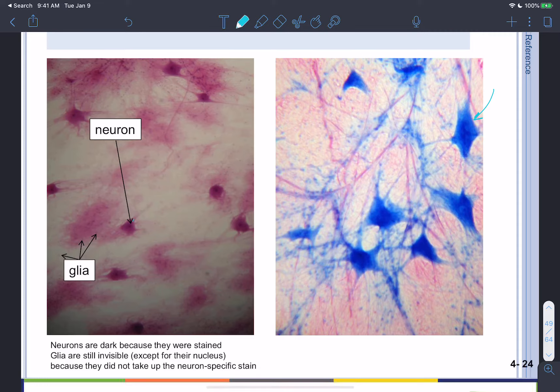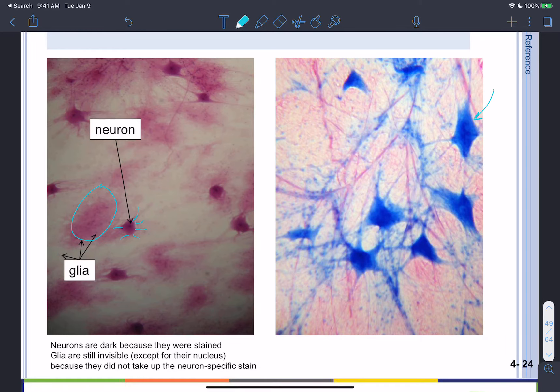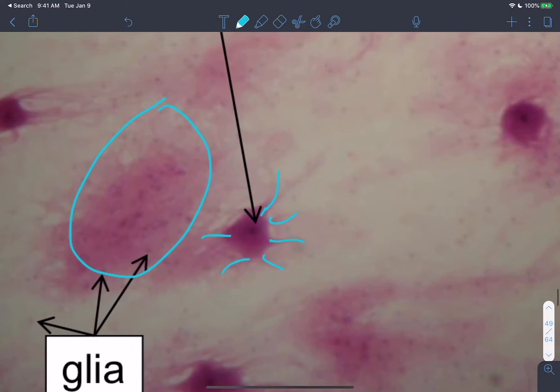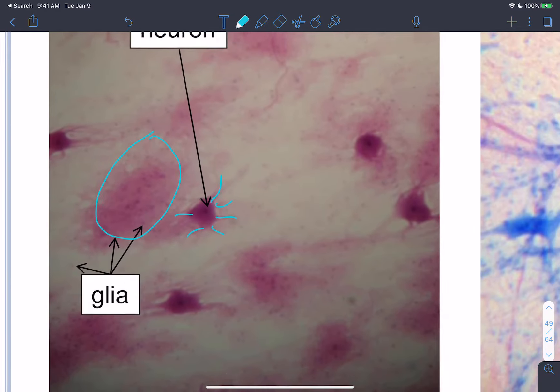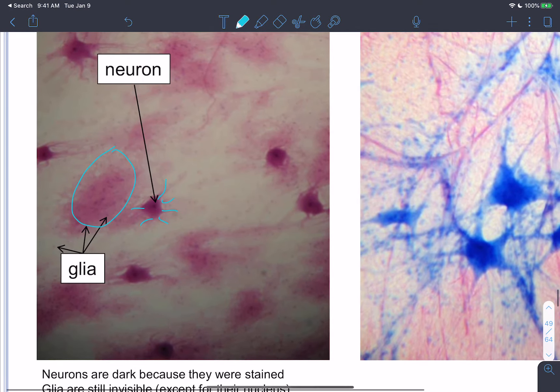Another nervous tissue slide shows neurons with processes coming out, and in the background are glial cells — if you look closely, you can see their nuclei. These are the supporting or glial cells of the nervous tissue.